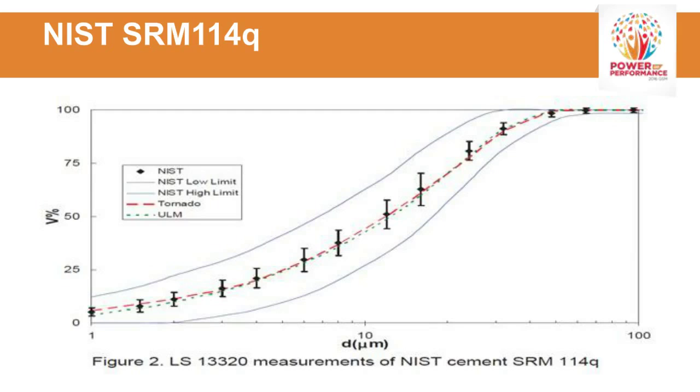And so this shows quite good agreement between both wet and dry. Cement typically disperses pretty well, both in a wet and dry state. So when there's no problem with dispersion or stickiness of materials, wet and dry should agree with each other similarly like this. And this shows the quality of data you can expect from the LS for running cements.